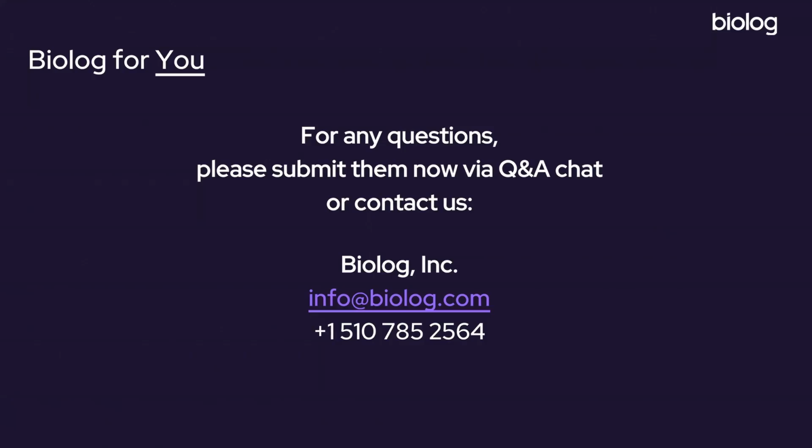Right. And actually, you have some clues just from the agar plate that you've incubated. If you can see that it's a really fast growing species, then you would know that you'd want to check at an earlier time point. But if I see small colonies, I might be okay waiting. If I get in late the next morning, I might be okay waiting a little bit over that. Your assay shouldn't fail if you are a couple hours late on your last read.